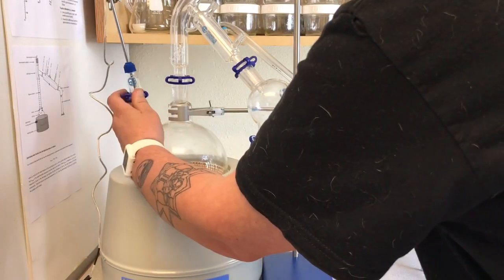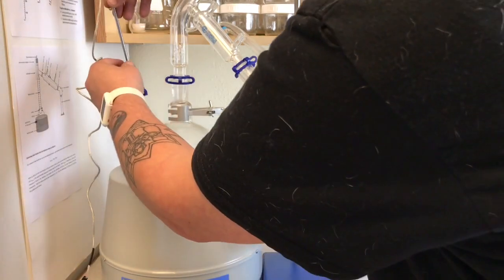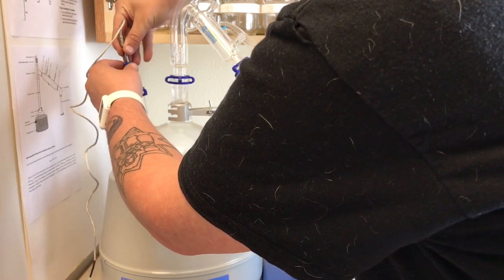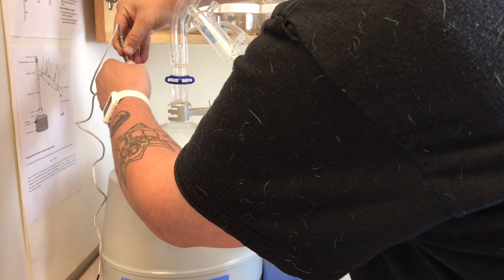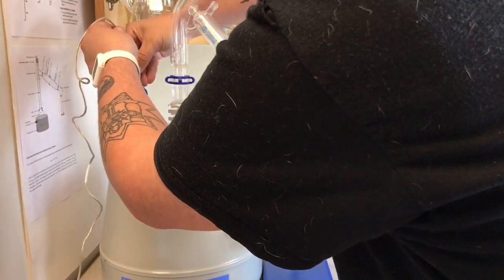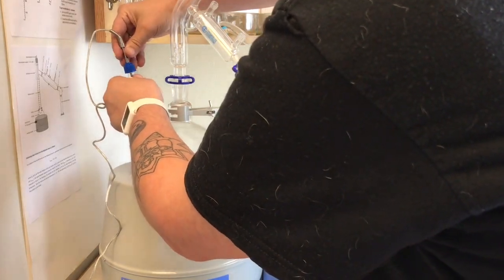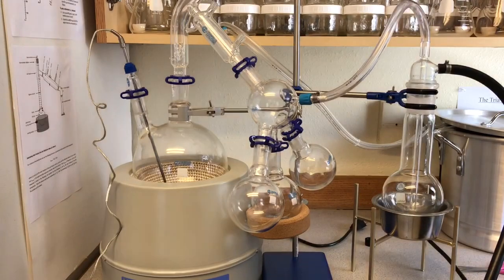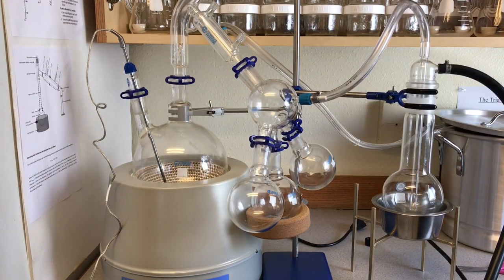So we've got our vacuum grease, and we've got our keck clip. Now we'll hold this about down where we want it. We don't have a lot of material this round, so I'm going to put this one almost to the bottom here. And there we go, nice tight seal. Alright, so we have one more piece to go, and that will be our thermometer, and our thermometer is going to go up top here.